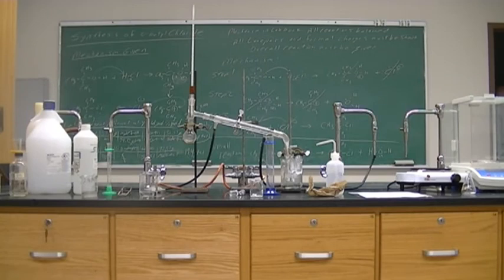All right, so we are ready to start our distillation.